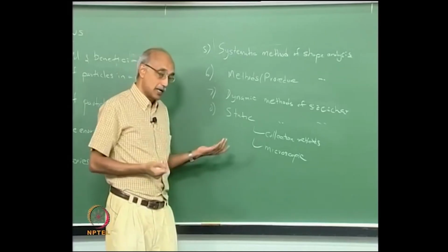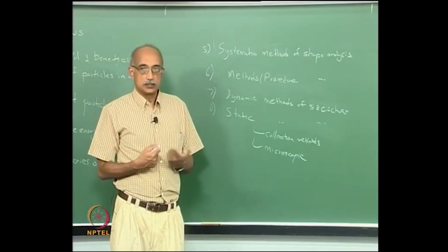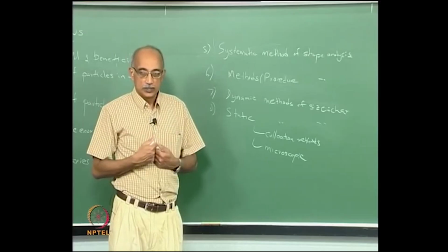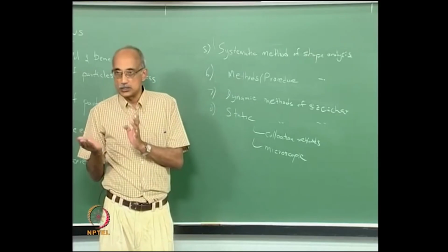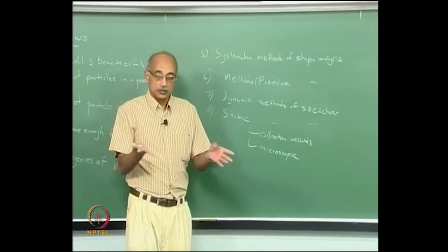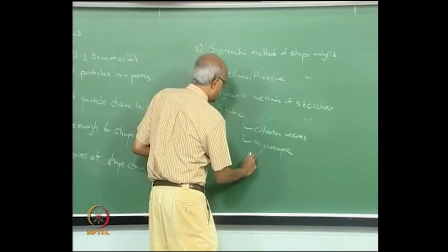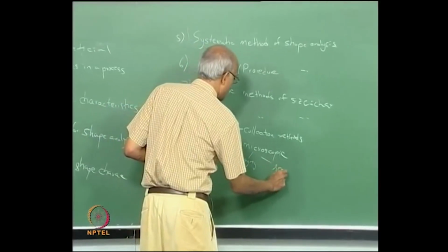You can irradiate the sample using various sources of light. You can use visible light, or you can use UV light, or of course you can use electrons, and each one will show up particles with different features and characteristics. We also said that this type of analysis of particles on a surface could be done either in imaging mode or in scattering mode.